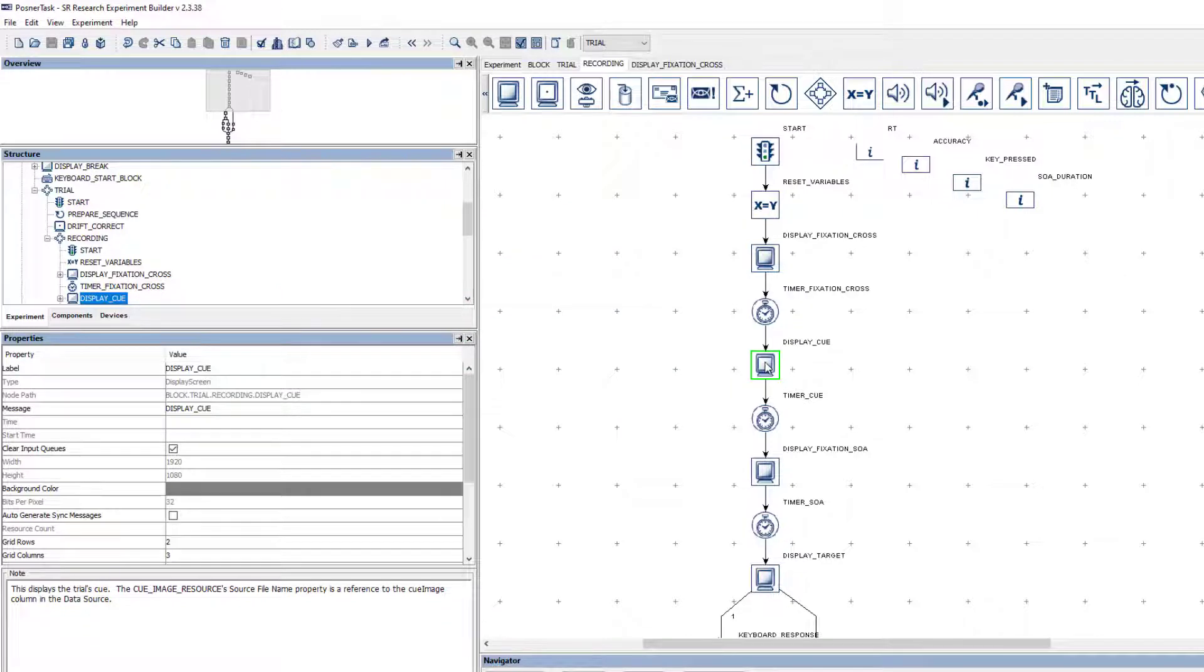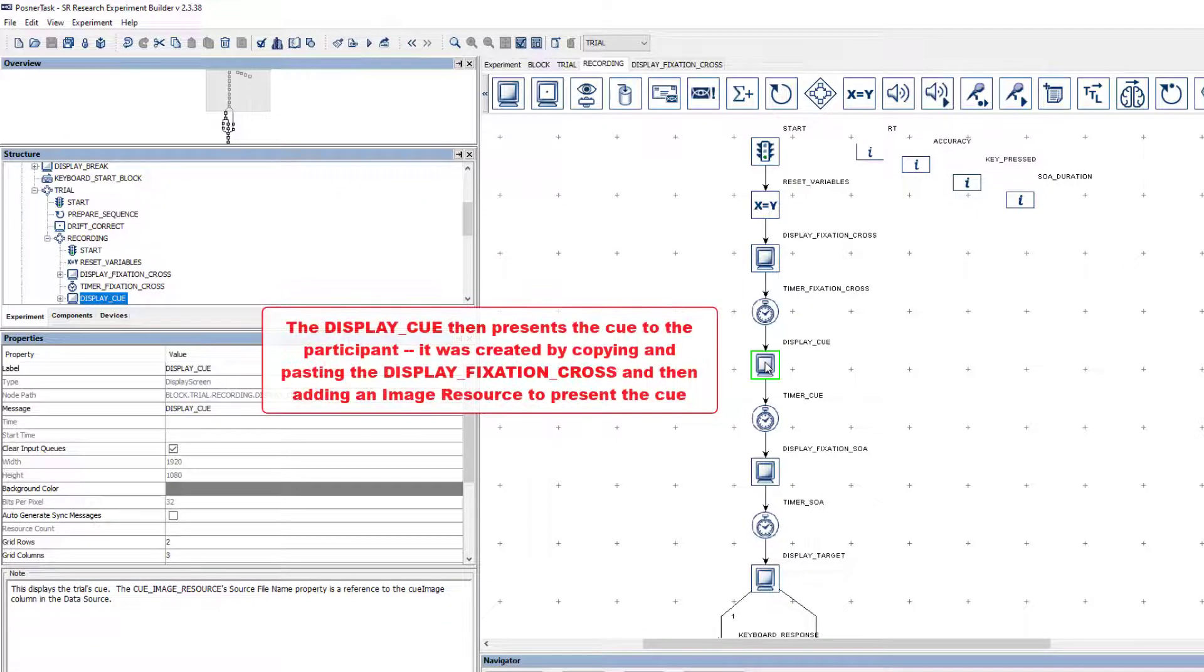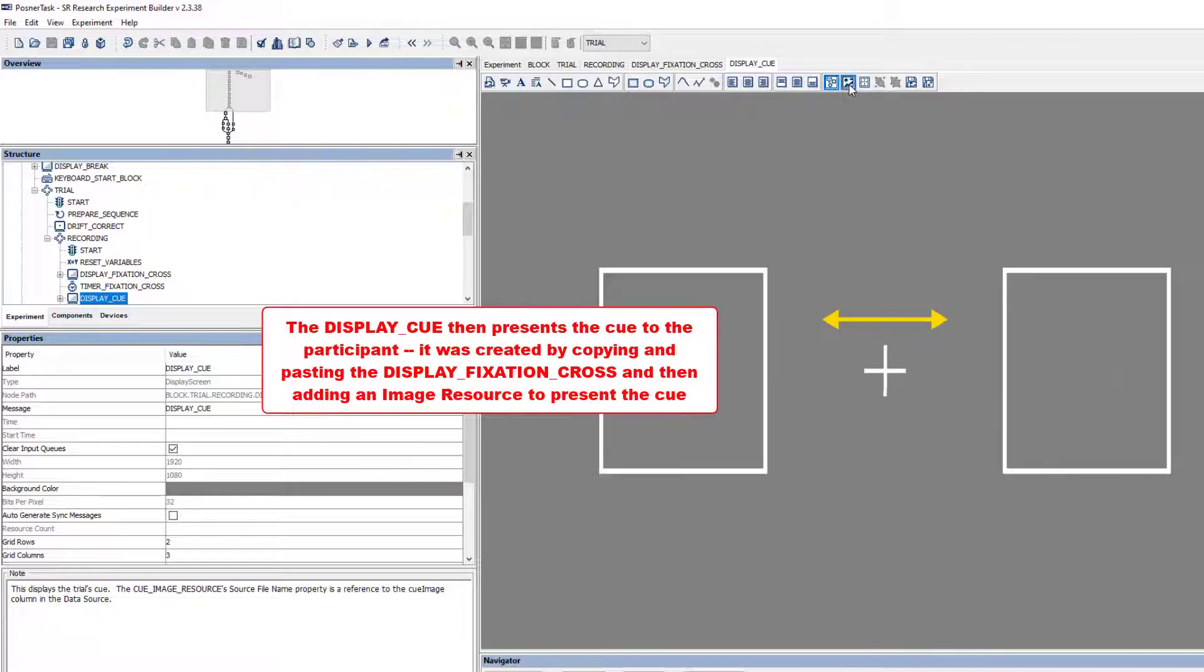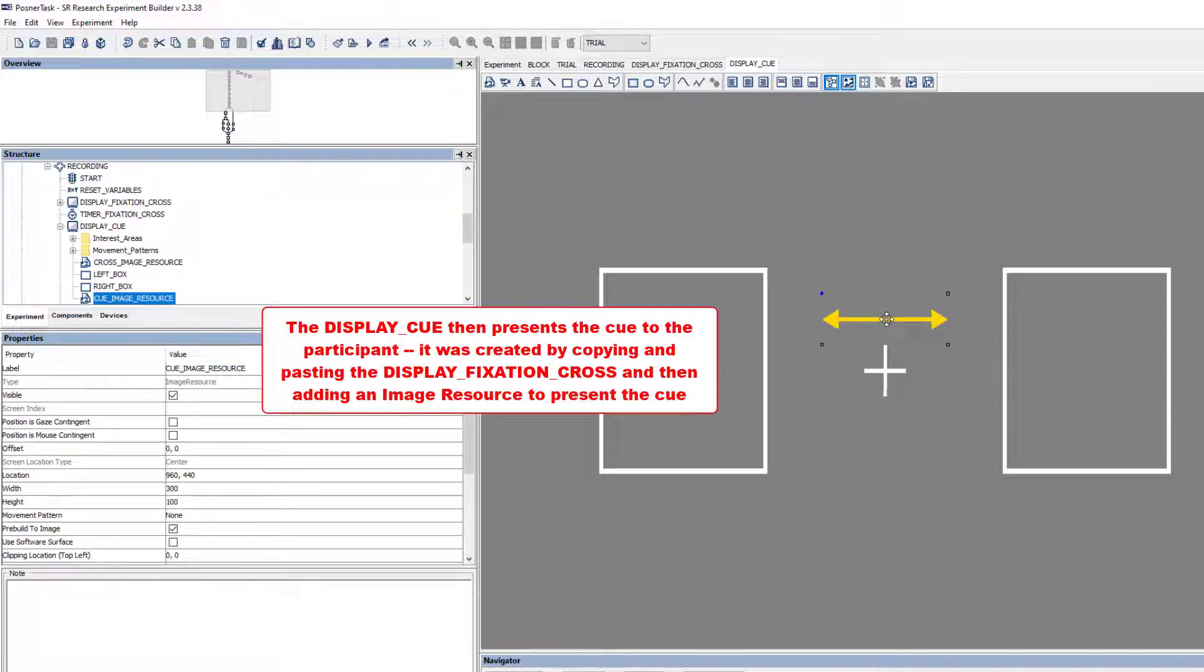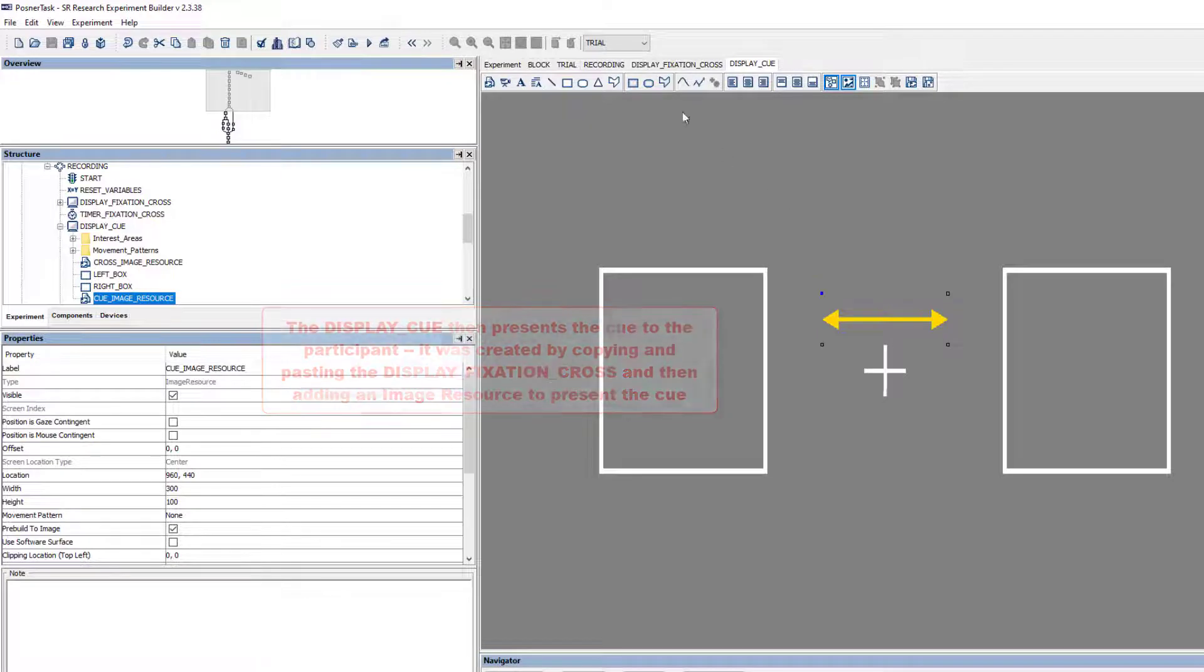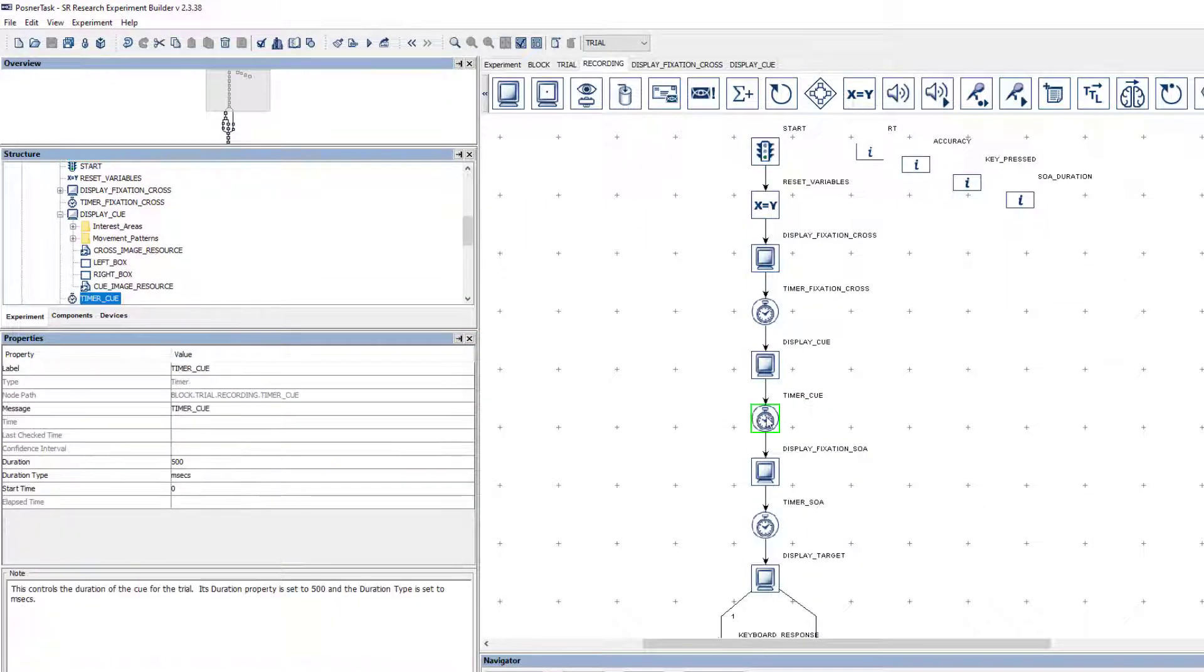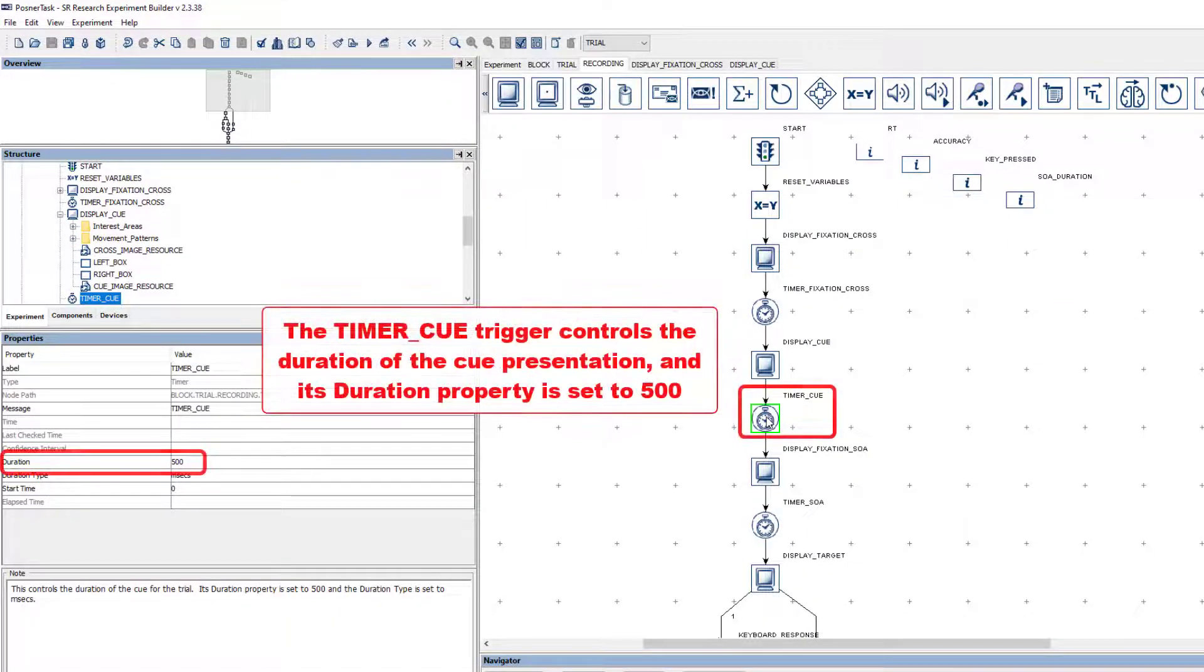Following the presentation of the Fixation Cross, the Cue should be presented, and the Display Cue performs this presentation. The contents of the Display Cue action are identical to the Display Fixation Cross action, with the exception of the addition of the Cue stimulus. Its presentation should last 500 milliseconds, so the Timer Cue trigger's duration is set to 500.